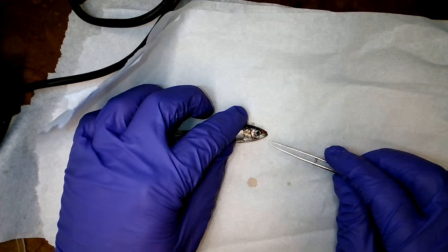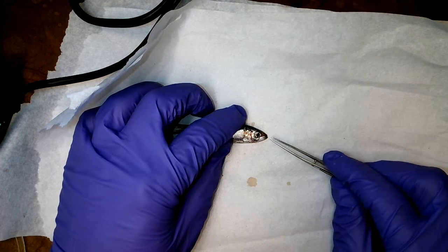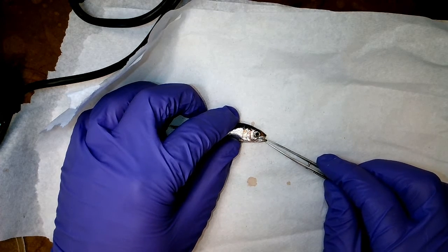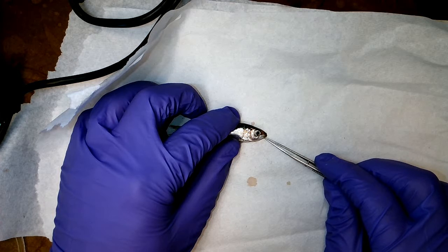What you're looking for in a projecting lower jaw is basically a big overbite. So this lower jaw would be extending well past the upper jaw, the upper lip there. When closed, you can see that these line up pretty evenly.